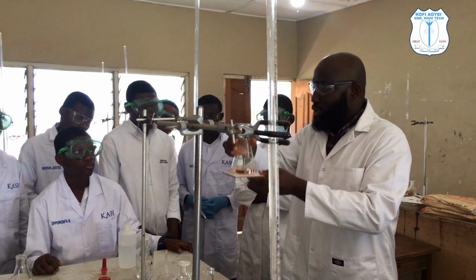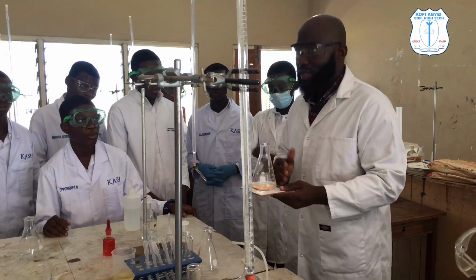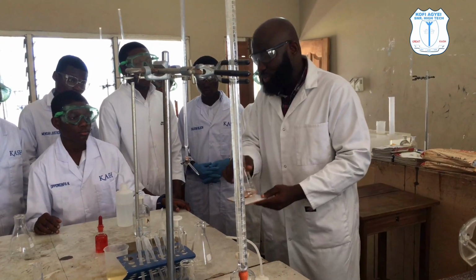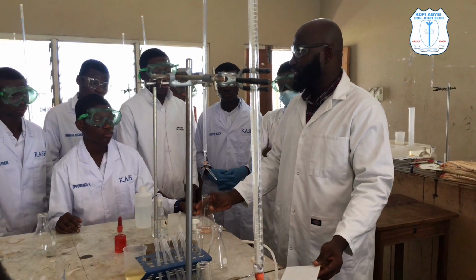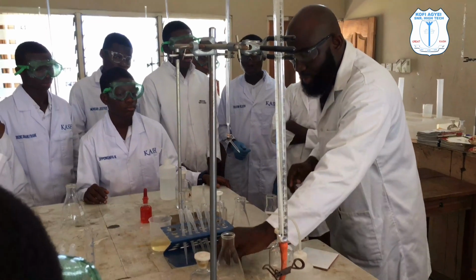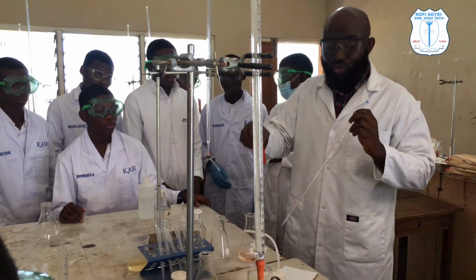Do you get it? So once you use methyl orange, it changes from yellow to what? Orange, or from yellow to what? Pink, depending on the nature of the substance. Understood? So basically, that is the point of simple titration. So the acid in the burette, the base in what? In the pipette. You add 3 drops of methyl orange into what? The base.